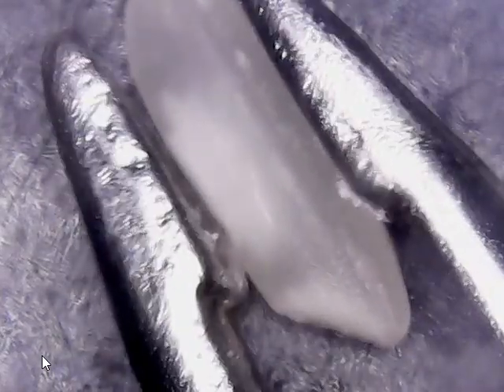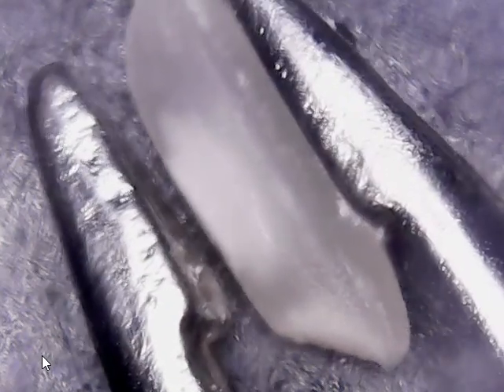Now if I shake that off and grab say this one, this one, the top curves up, curves off to the right, and then the bottom just goes in a straight line, see? Rice is not at all uniform.